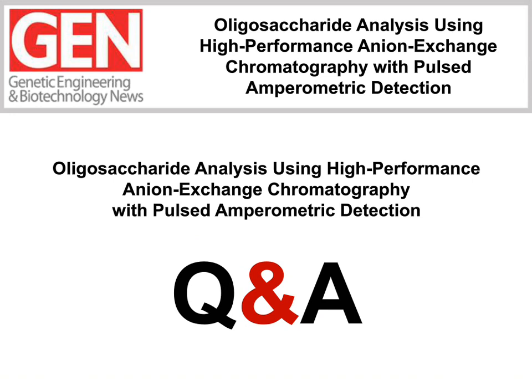So that would make the sodium hydroxide water, but it would make the sodium acetate weak acetic acid. In that case, we'd probably dry the sample to remove that. And when we have the weak acetic acid there, if we sat that long enough, if we had sialic acid present in our oligosaccharides, we'd lose some of that. So we'd have to get that dried quickly. You could do the same thing by dialysis, too, and that's what we've done in the past.